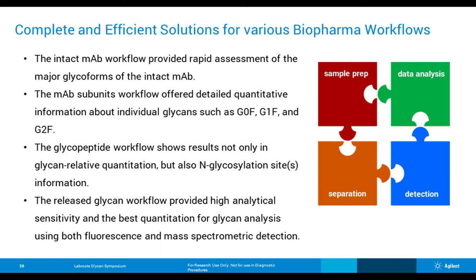Okay. All right, next, can you use the BioConfirm released glycan software with a different sample prep or LC system? I think you mean whether we can use BioConfirm to analyze the glycan with a different fluorescent tag labeling. Yes, you can do that. BioConfirm allows users to customize the labeling tag by using either the mass of the tag or the chemical formula of the tag.